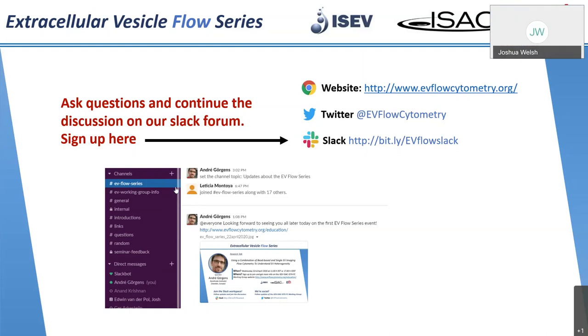So one of the questions is, what happens if the EVs express two or more molecules when they're incubated with these capture beads? Yeah, again, ultimately, I don't know. I guess some will cross-link to two beads or multiple beads, or they will just bind stochastically, to some extent biased, to a certain EV subset. That's what I imagine. But ultimately, I don't know. So again, I would rather rely on a semi-quantitative quantification and conclusion in the way of it being either high or low. And of course, it might hamper the detection of low abundant antigens in particular.